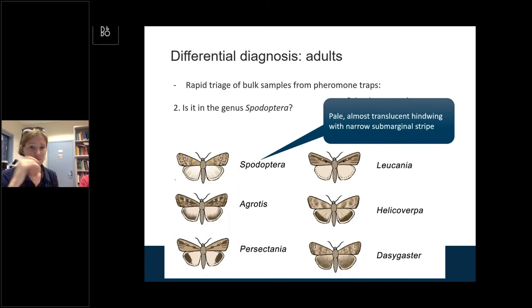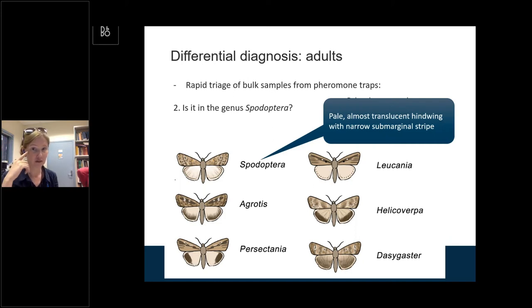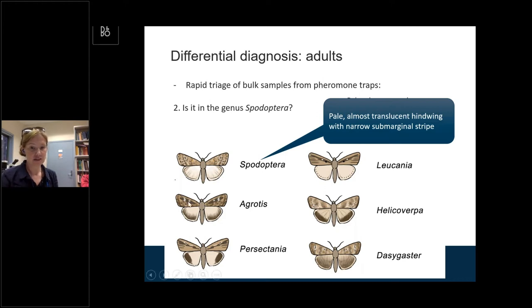Once you have a brown, nondescript noctuid in your trap sample, the next thing you want to know is whether it belongs to the genus Spodoptera — the genus of fall armyworm, which also includes many native species. The best and fastest way to triage Spodoptera from non-Spodoptera noctuids is hindwing coloration. Spodoptera have a very pale, almost white, translucent, sometimes even opalescent hindwing without significant brown markings. Everything else — from Helicoverpa to Agrotis, the Bogong moths and their kin — have much more dark brown patterning on the hindwing.